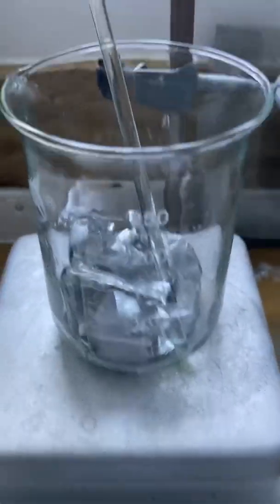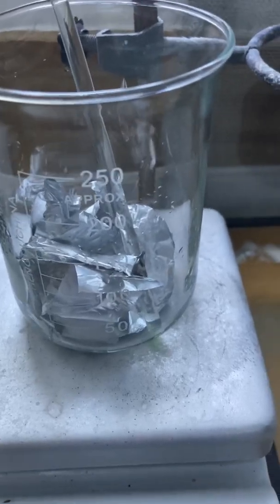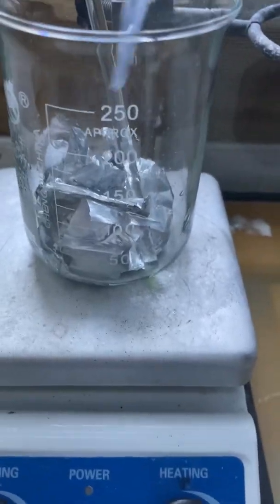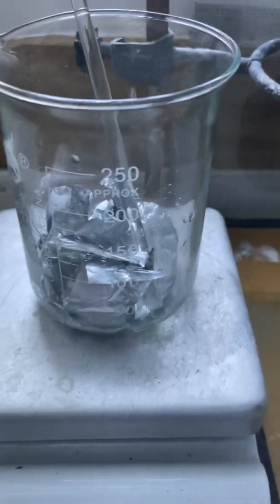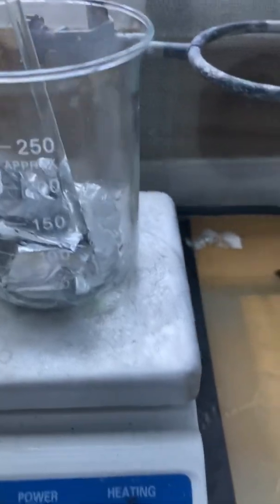Howdy folks! In this beaker I have some aluminum foil. I'm now going to add some hydrochloric acid to it and the reaction should proceed. That forms aluminum trichloride and hydrogen gas.